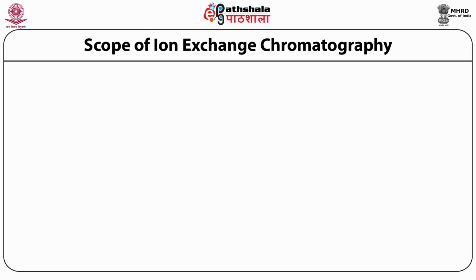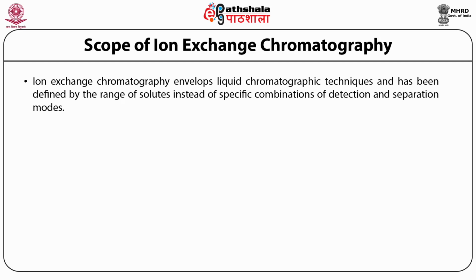Scope of ion exchange chromatography. Ion exchange chromatography encompasses liquid chromatographic techniques and has been defined by the range of solutes instead of specific combinations of detection and separation modes. It is devised explicitly for the segregation of differently charged compounds between stationary and mobile phases.